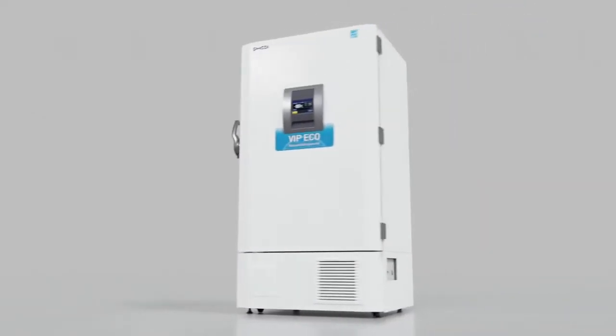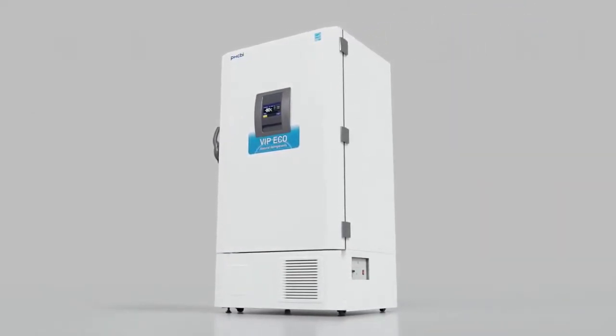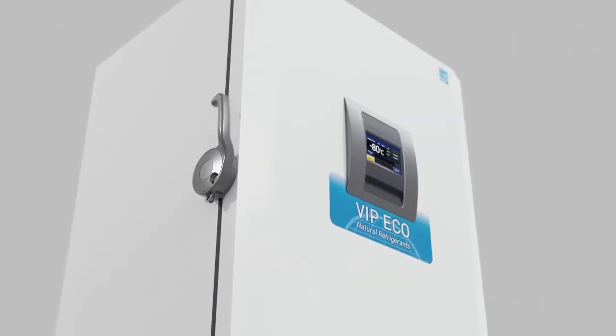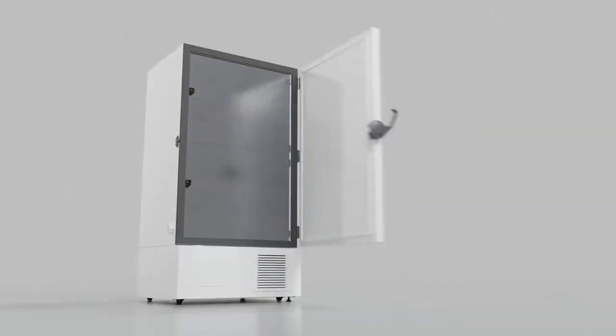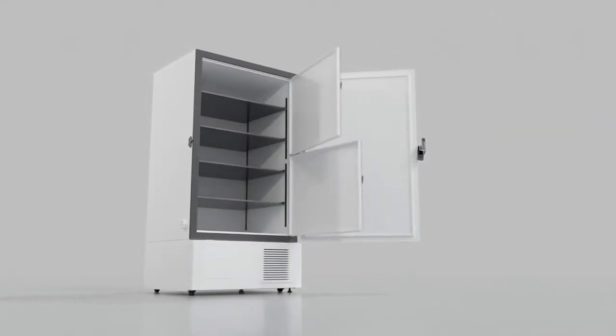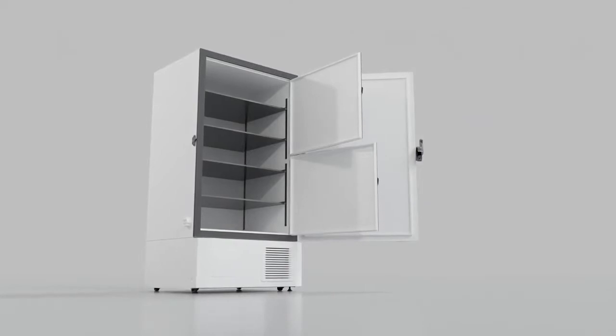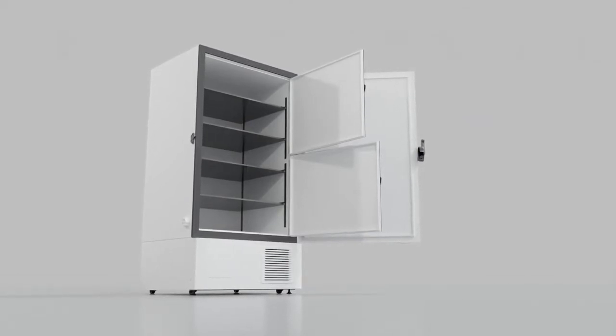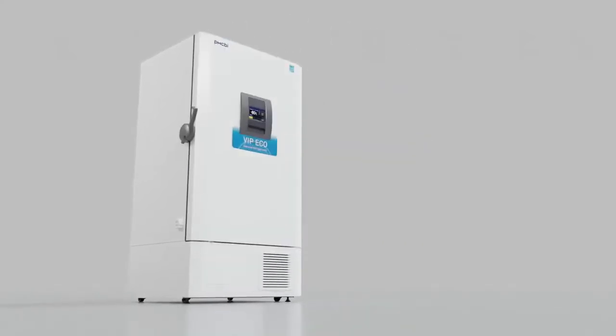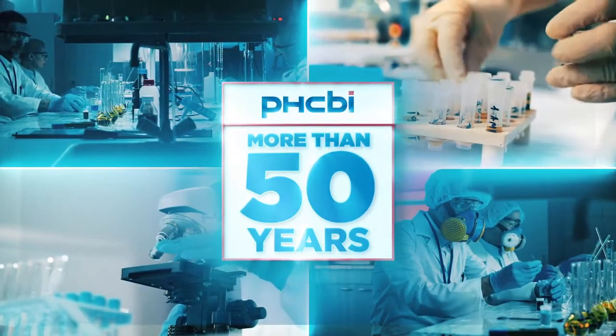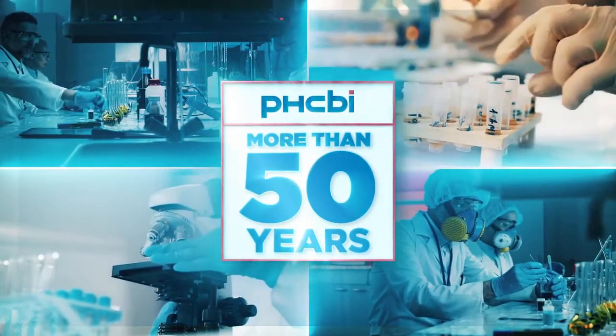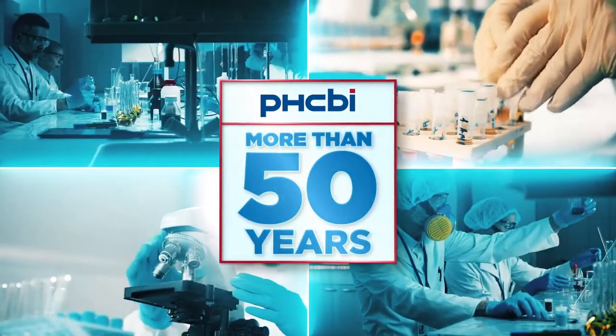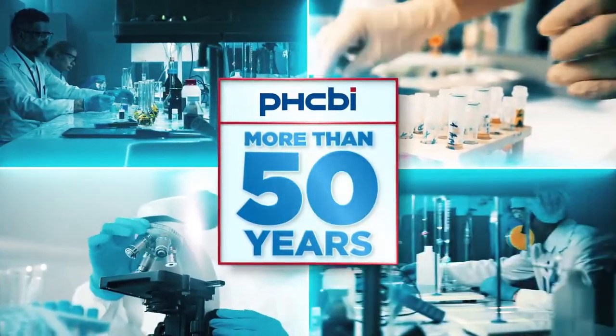When it comes to ultra-low temperature freezers, your research demands consistent, dependable technology from a partner who understands that your samples are invaluable. They need to be kept at a consistent temperature at all times, and you don't have time to worry about it. PHC Corporation has spent more than 50 years designing and refining an entire system that works synergistically to preserve your biologics.